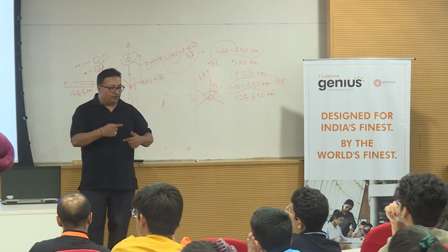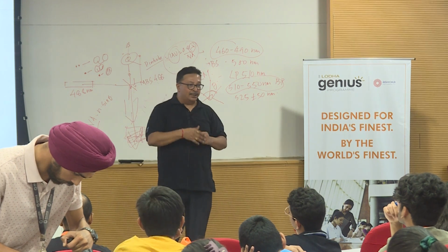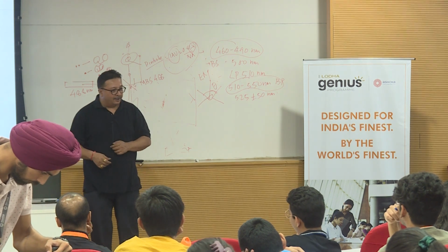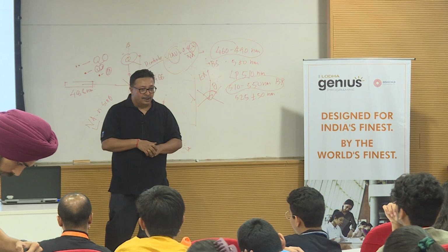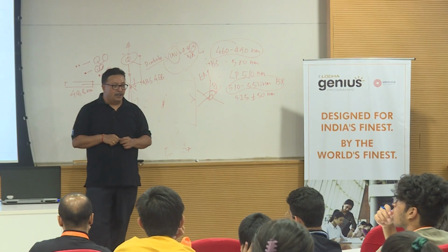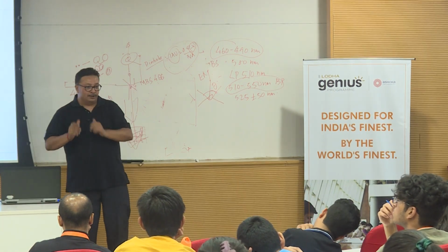So you see, from 2D I came to 3D, then it became 4D, X, Y, Z versus time. It became 5D, X, Y, Z versus time versus lambda. It went to 6D, X, Y, Z versus time versus lambda versus multiple positions, if I have a scanning stage or a motorized stage where I can have multiple locations, multiple positions of the sample. So I can go starting from 2D imaging up to 6D imaging.